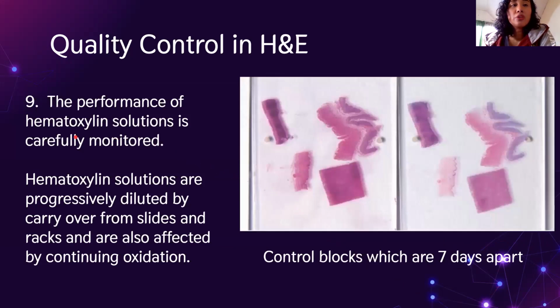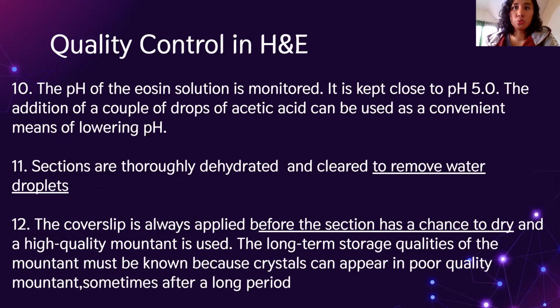The performance of hematoxylin solution should be monitored. So guys, this is 7 days apart. So ito kunyari nung Monday, yan, next Monday, ito yung itsura. So ikaw ba, 'di ba? So mas maganda ito. So might as well replace your hematoxylin reagents already because there are carryover and dilution. Yun nga eh. So, pag hindi maayos yung draining. So, might as well replace your hematoxylin solutions.